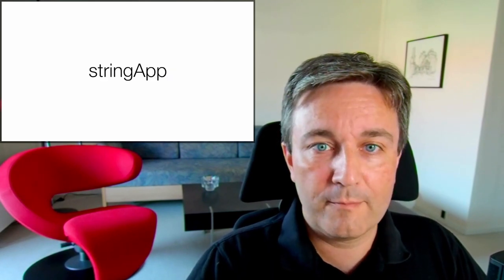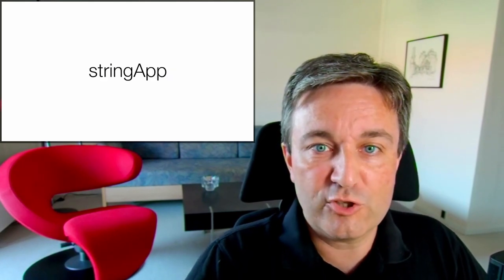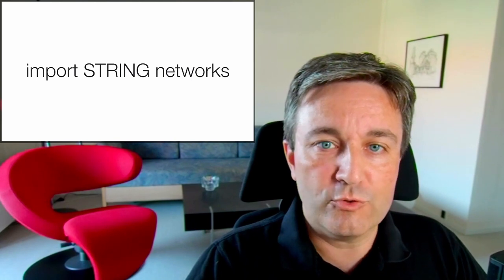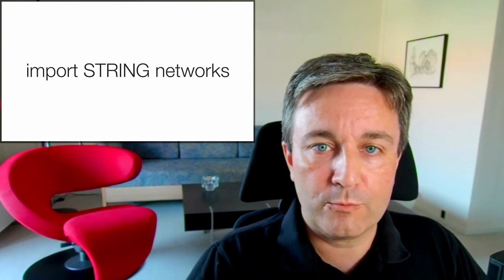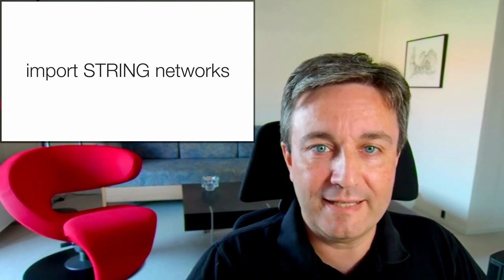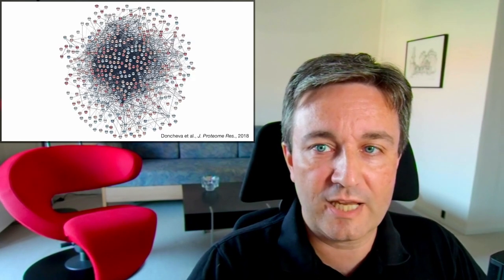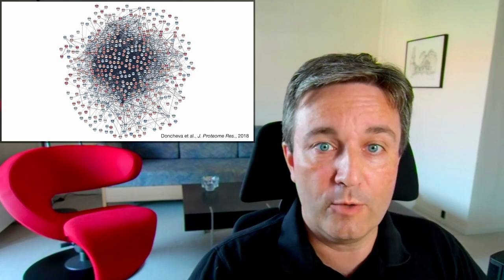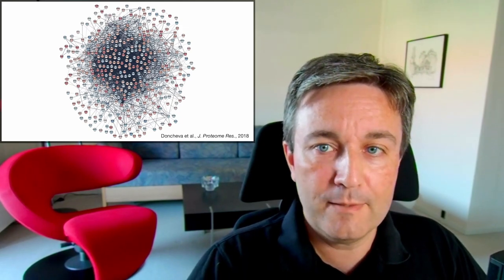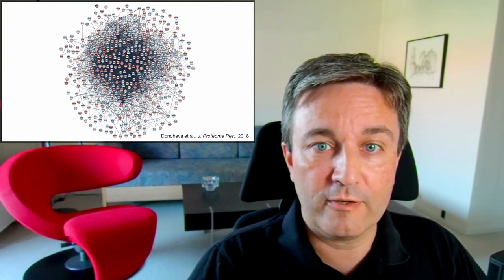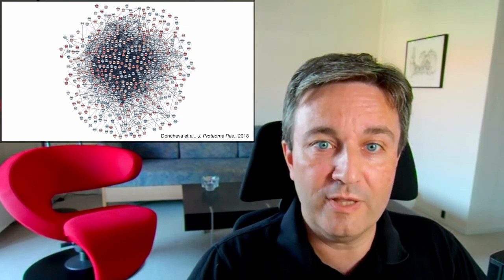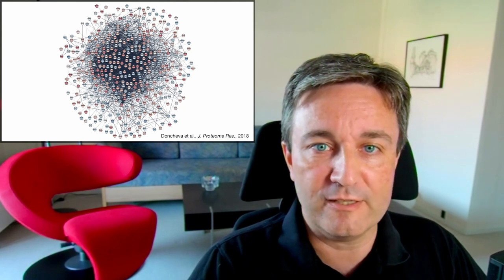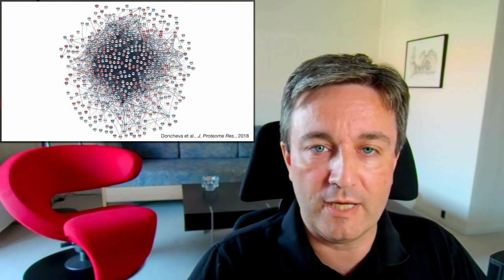It allows you to install apps into Cytoscape that extend the functionality in a variety of ways. One example of an app is the String App. It allows you to import networks from the String database straight into Cytoscape so that you can come with a long list of proteins and pull a network from String without having to use the import functionality that I just described.